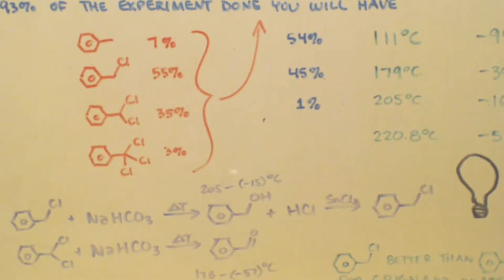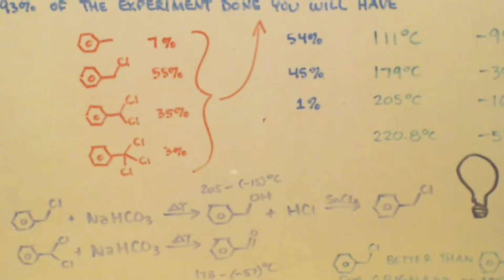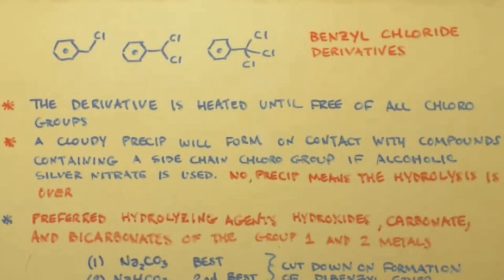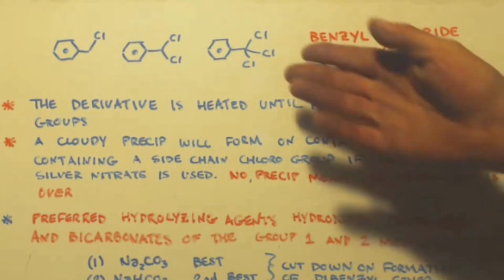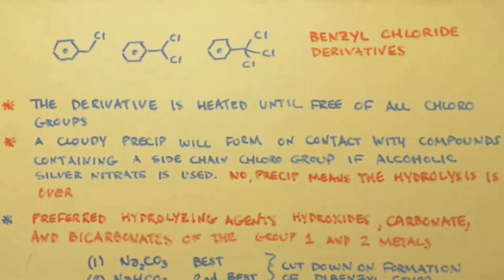What you do to hydrolyze these and get these chloro groups off and put on either a hydroxyl group, a carbonyl, or a carboxyl group. I wanted to reiterate about the benzyl trichloride. I didn't look up anything about how to make it. I would just guess, if you got 1 mole of toluene, 3 moles of chlorine, when it's done, it's done. That's after the 3 moles.